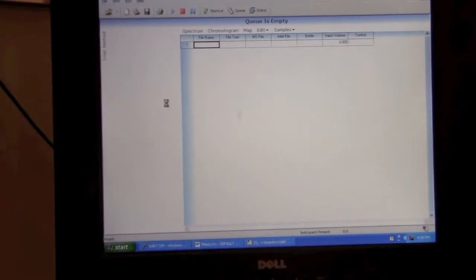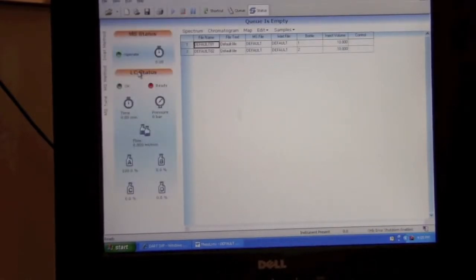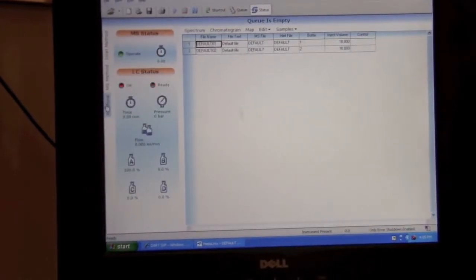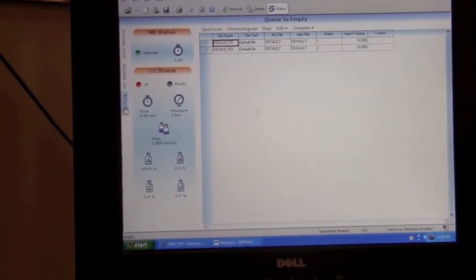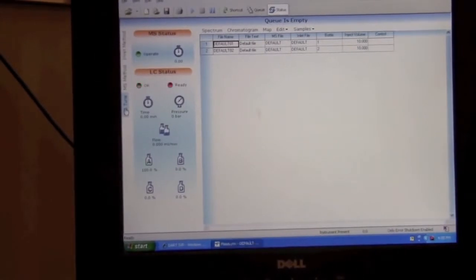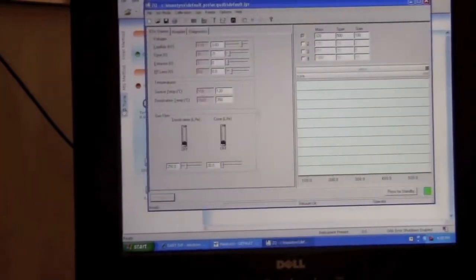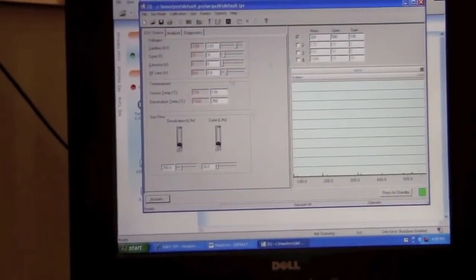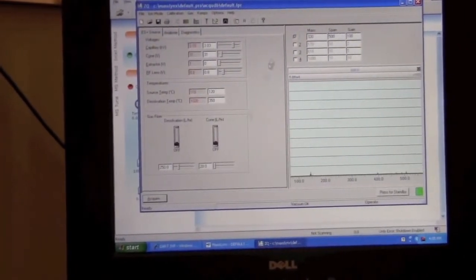After the page has finally opened, we should be able to get to MS Tune. So click on the MS Tune link. That will bring up this page.